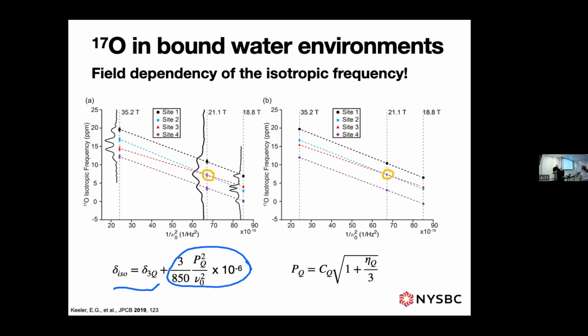We were operating on the 900 at about 4% efficiency. So it just was prohibitive. Even at 3Q, we were having trouble with enough sensitivity.